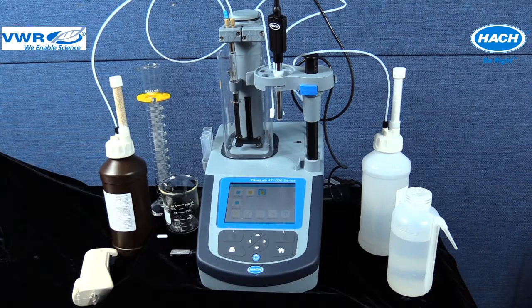The titrant side of this titrator has been prepared. This includes the following. The phenyl arsine oxide or PAO titrant solution was purchased, the bottle caps installed, correct syringe tubing, note the dispensing tip and downward arrow, fed through the bottle cap, and the desiccant cotton-filled tube installed in the bottle cap. The pump side of the titrator has also been prepared. This includes the following. Acetate buffer pH 4 solution was purchased, the bottle cap installed, correct pump tubing, fed through the downward arrow through the bottle cap, and the desiccant cotton-filled tube installed in the bottle cap.